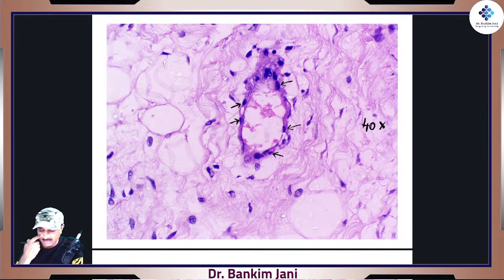So today our main concern is, first, to identify the type of cells, right? So in arterioles, when this particular artery is sectioned, it shows these flat nuclei, right? Someone might say that this one is rounded. Well, possible.